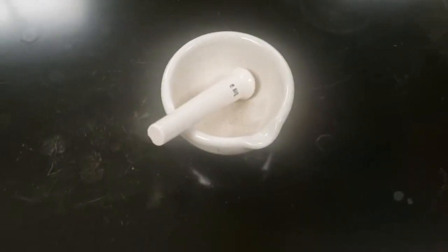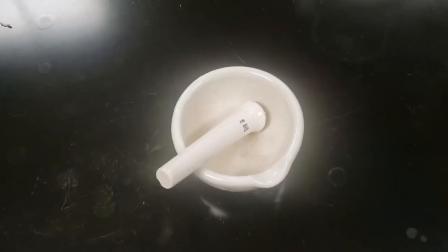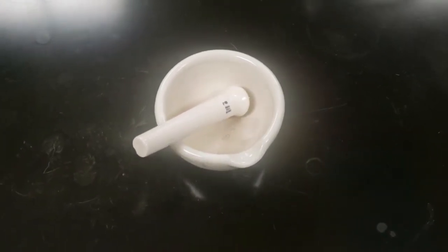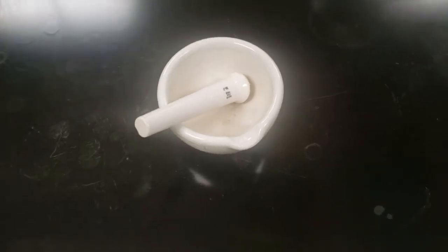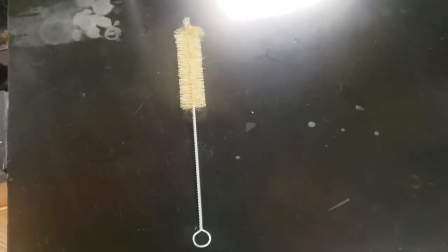Here's a mortar and pestle. It's good for grinding up solids that have stuck together. It's also good for herbs and things like that when you're cooking in the kitchen. So sometimes the chemicals get stuck. Here is a test tube brush or a beaker brush, depending on the size of it. It's good for scrubbing the insides of glassware with soapy water.